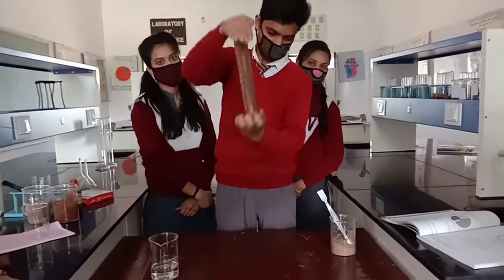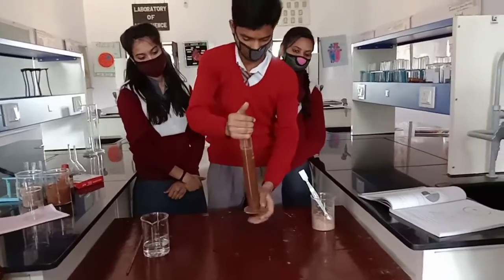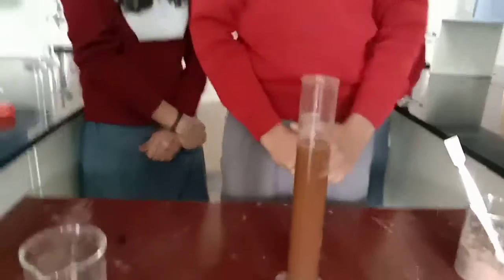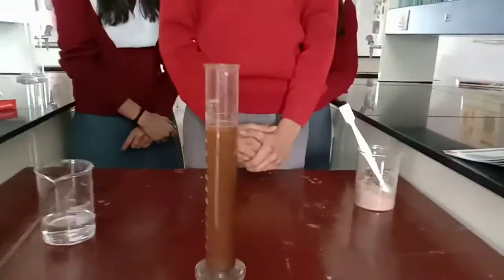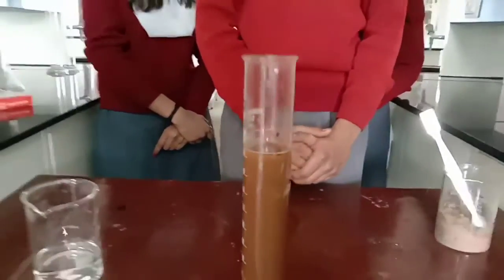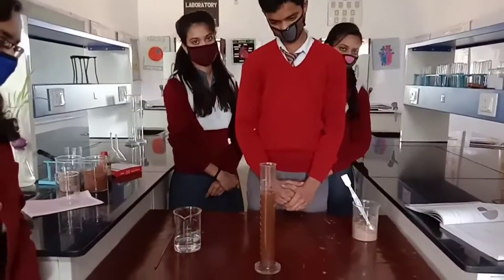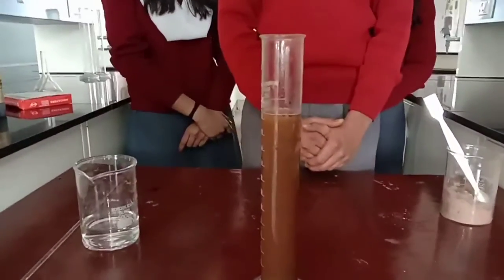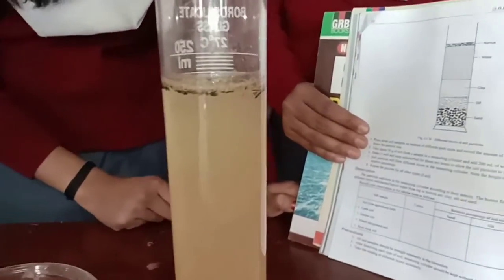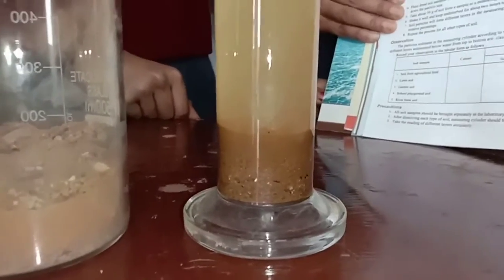Now, after shaking it, we'll allow the soil particles to settle down. Minimum it will take 30 minutes to settle down. After 30 minutes we'll see the observation. After half an hour we can see here that all the soil particles have settled down. Now we'll record the thickness of each layer formed by different types of particles in the measuring cylinder.